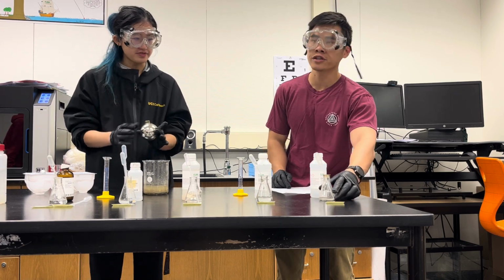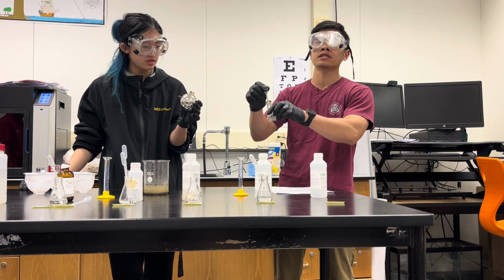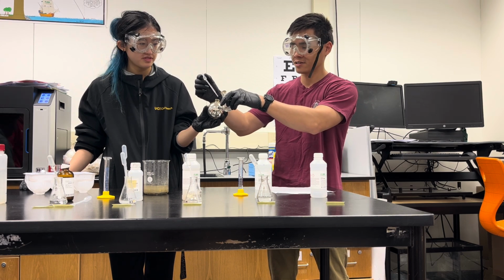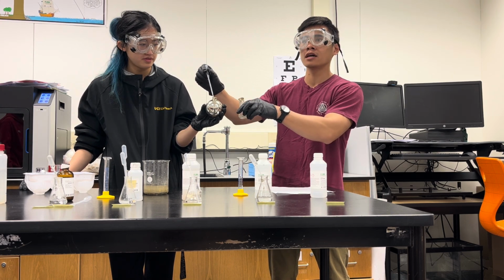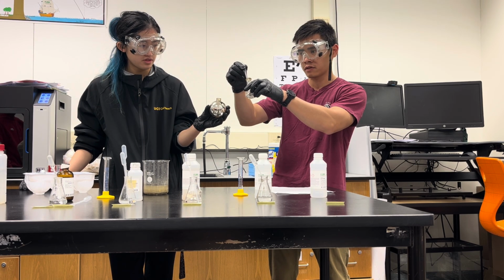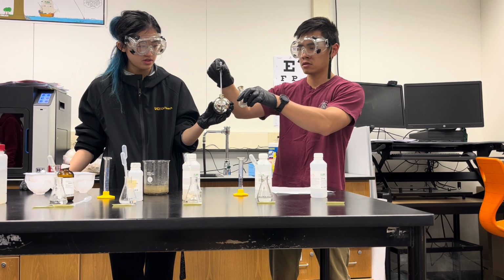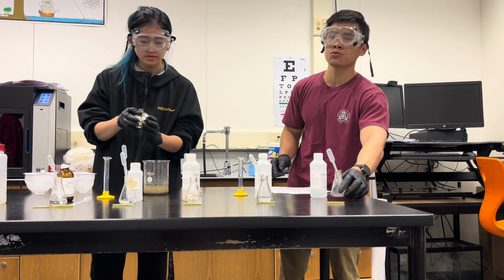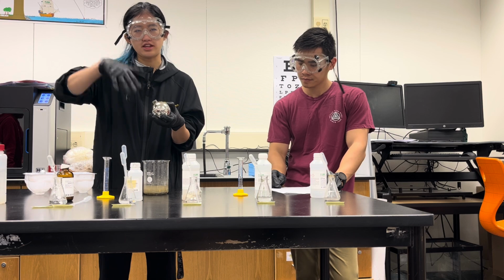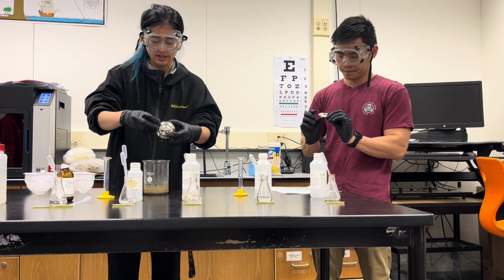And we want to make sure that the silver part stays. So the way that we make sure that the silver part stays, Michael and Esme, is I'm going to put a pipette of acetone, 2 pipettes for 2 milliliters of acetone. And we're going to do one last swirl and drain. So this kind of like seals everything in, basically. So make sure again that it coats everything.